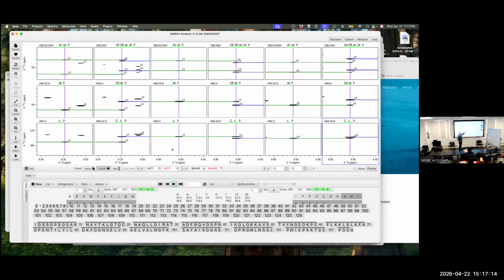This is an HNCO of some residue. It's actually the CO of the I-1 residue. Somewhere in the protein is a CO in an HNCACO experiment. It should be that same CO. And what we've done with this matching is give us a list of possible matches. You can see this C1 peak here matches this peak here. In the CA, you can again see this peak here matches this peak here.